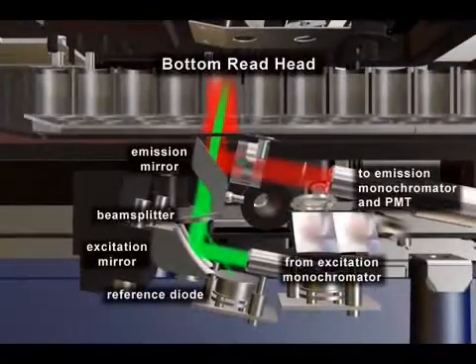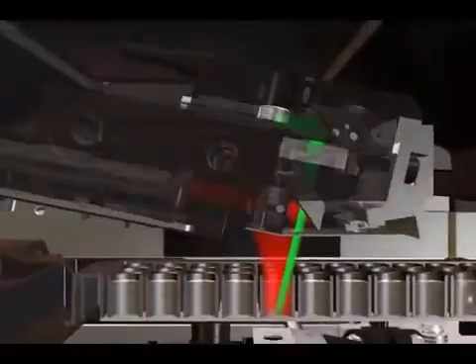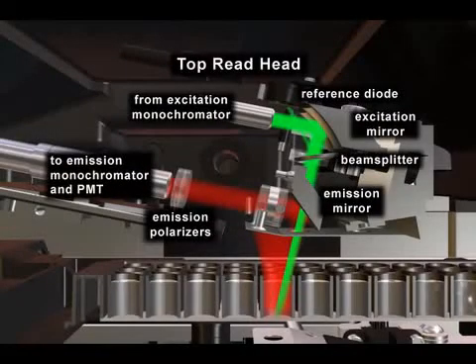Let's begin with Fluorescence Mode. Our unique patented read head gives you maximum sensitivity with minimum background. The top read head gives you the added feature of fully tunable fluorescence polarization. There are no dichroics or filters to manage for fluorescence polarization.